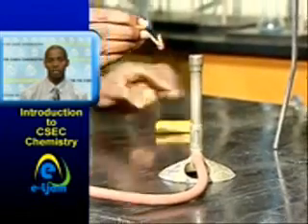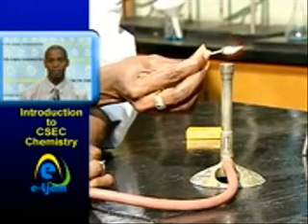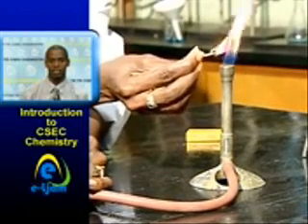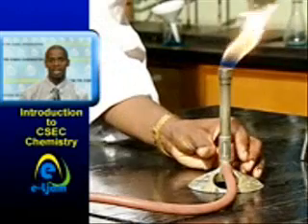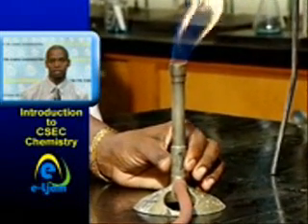The safety flame is the coolest. This flame is yellow-orange and burns at approximately 300 degrees Celsius and is never used to heat anything but shows that the Bunsen burner is lit.